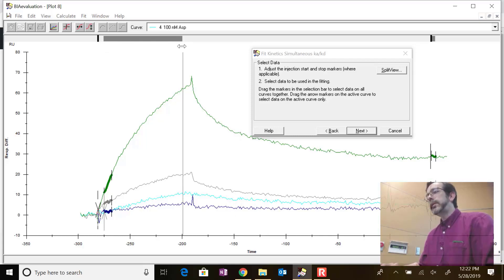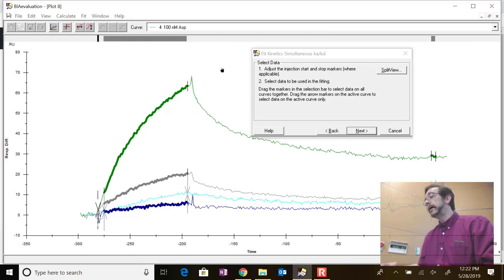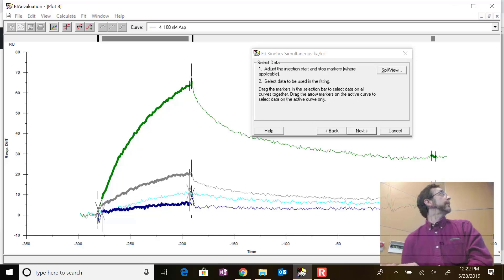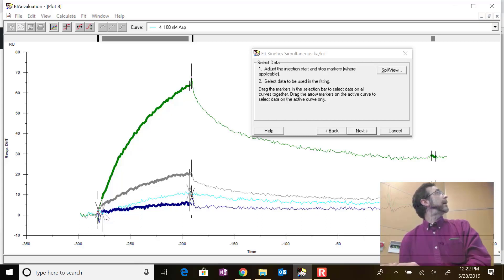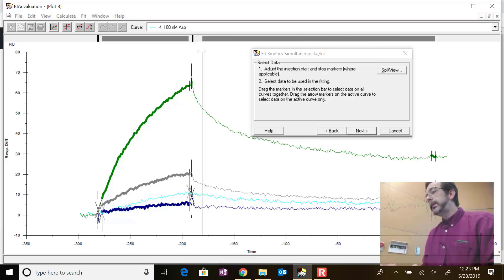You always want to give a little margin. You can see on the edges we have little spikes - that's clearly not real data. We want to try putting the beginning of the reaction right on the spike and then get as much of the data as we can, leaving a little margin for the part where it's still recovering from the spike. You can look at this and say those all look like real data. There's a slight crossover here that could cause a problem, so I might move the fit region slightly to the right.